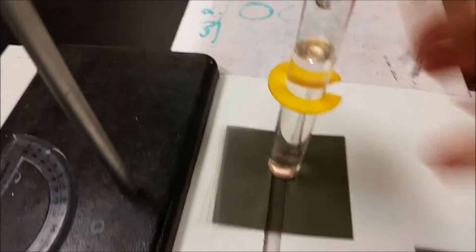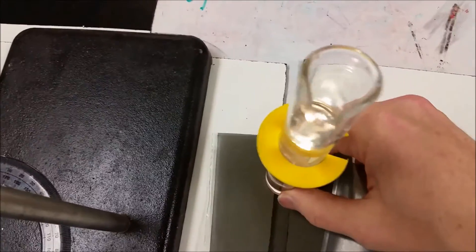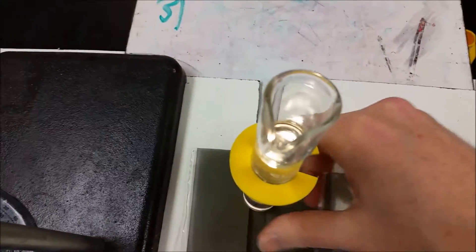Now, as I go from 20 to 10 to 5, the 5% solution is not going to do that as much because there's not as much chemical present. So here is the 90 degree, and you can see that only a slight rotation gets you darker, and then after that it gets lighter again.